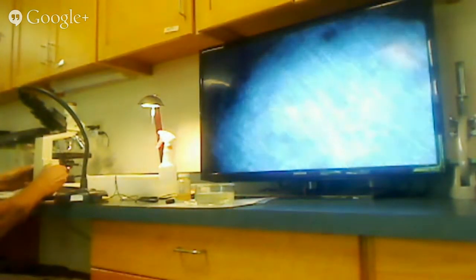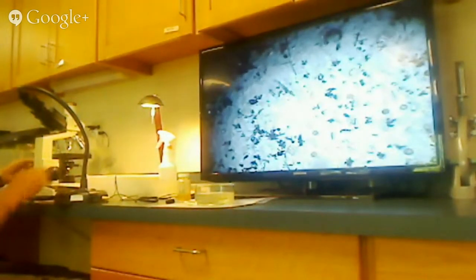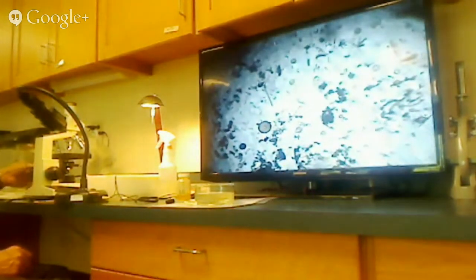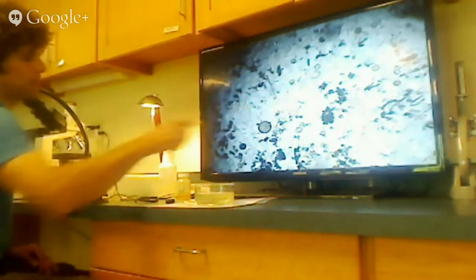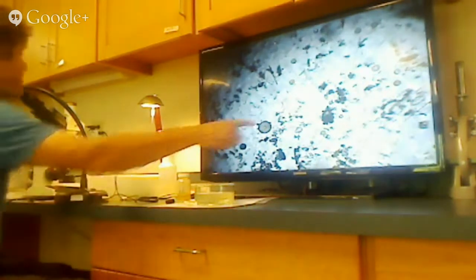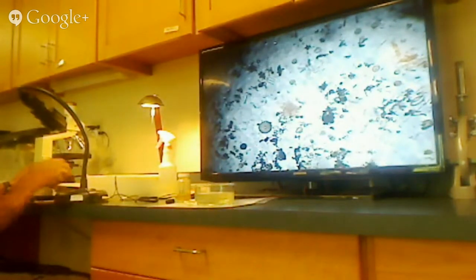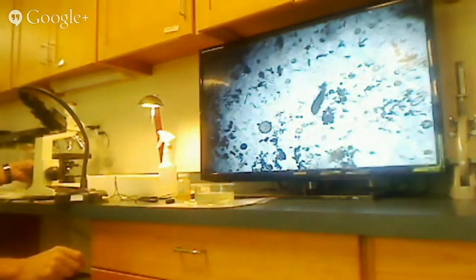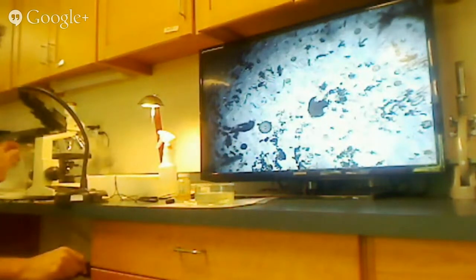And then you can begin to focus there. And now you can really start to appreciate the different life forms. These are microscopic plants called diatoms. And the diatoms, and then we've got some chains of algae. So we can get those up. And here we've got a larval barnacle, another. These are barnacle larvae called cyprids. Here's a little copepod. Here's another copepod.